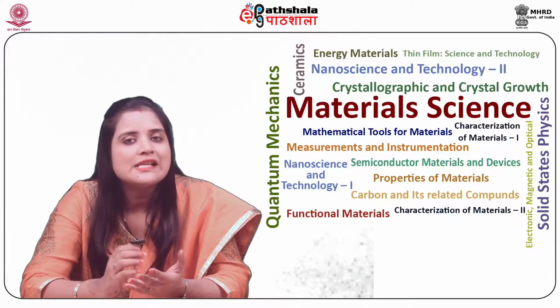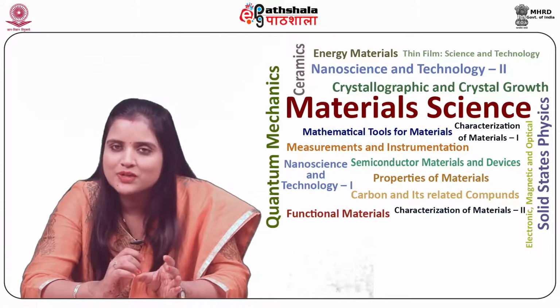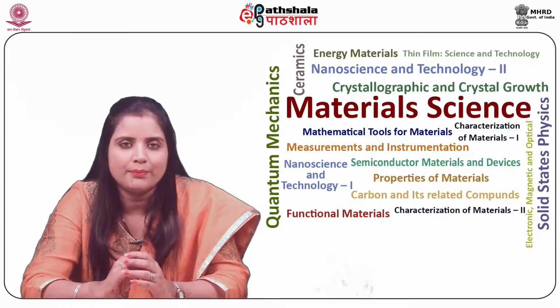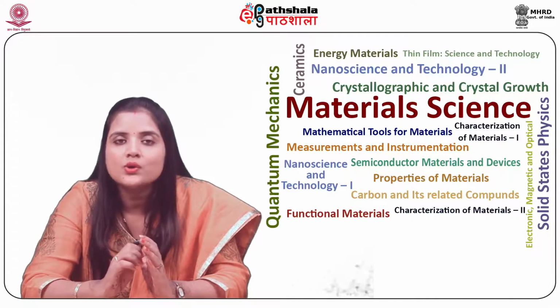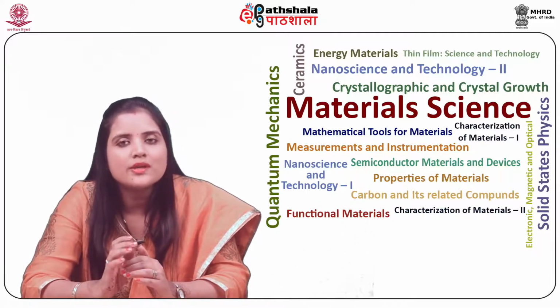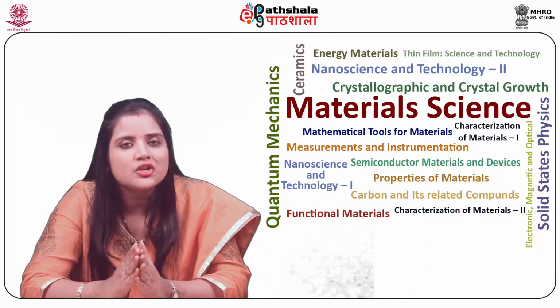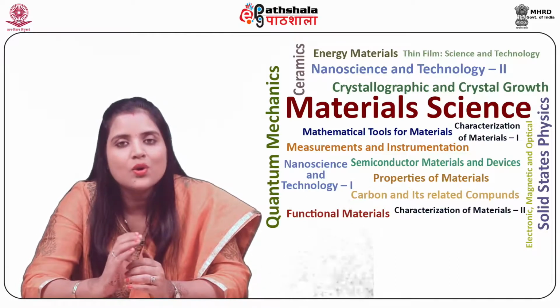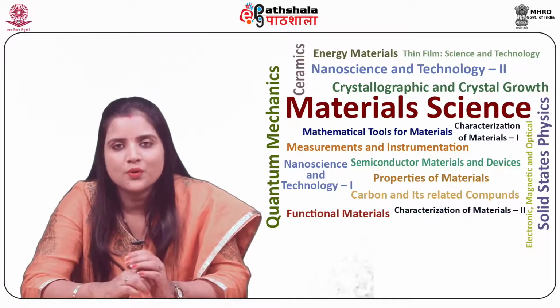The EDS detector is a self-enclosed vacuum system which is called the cryostat, having liquid nitrogen or cryogenic pumping. The crystal and FET are mounted on a cooled finger within the cryostat to reduce noise by cooling. The cooling is necessary as the detector produces small charge pulses. At low voltages, the resolution of the detector depends upon the noise.